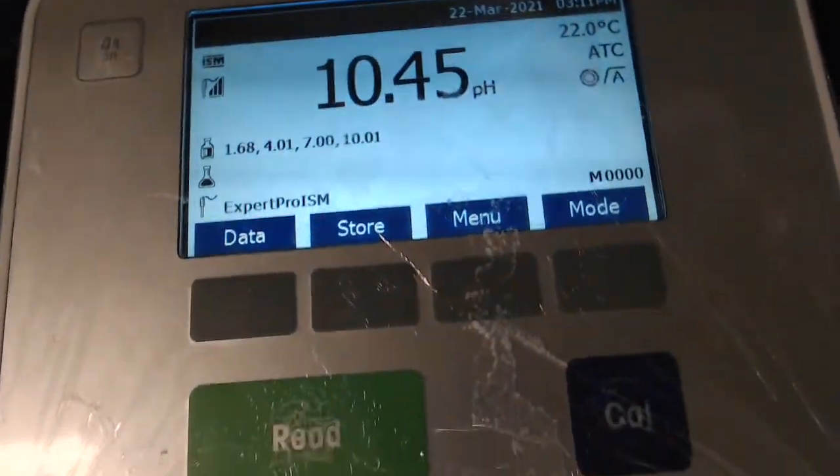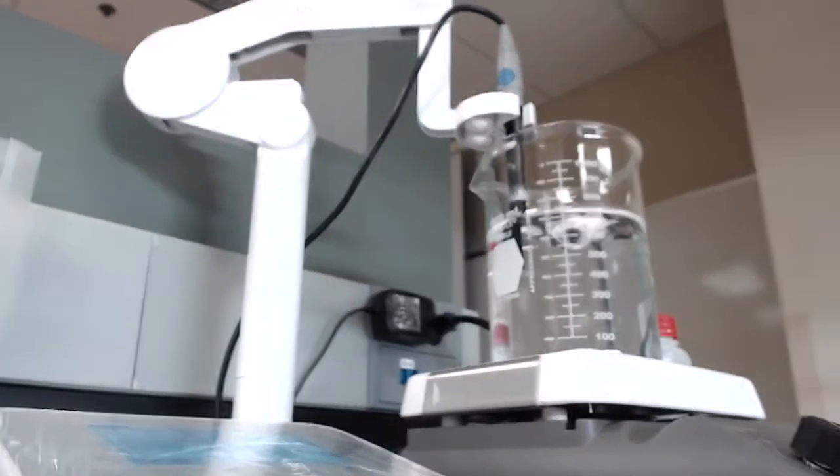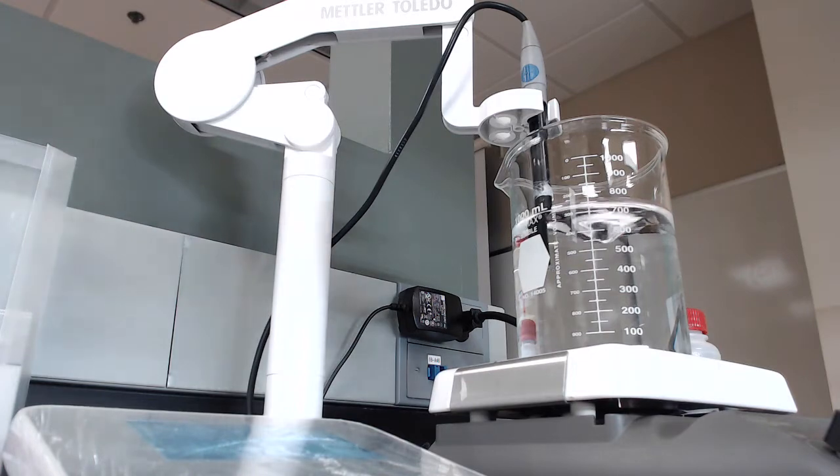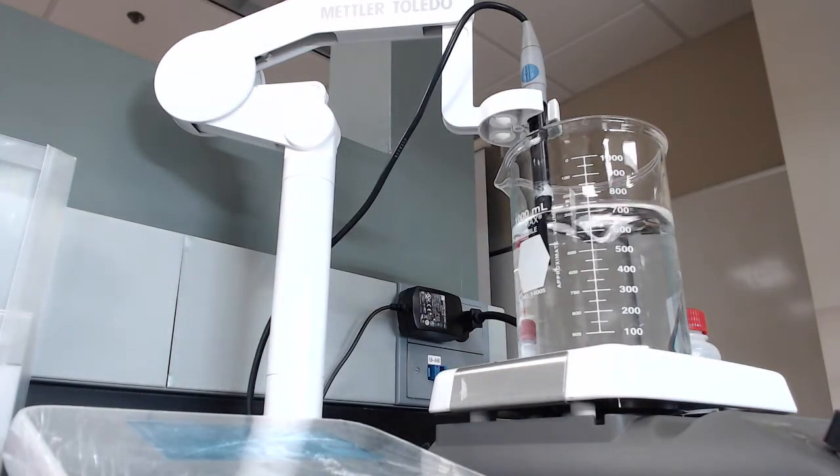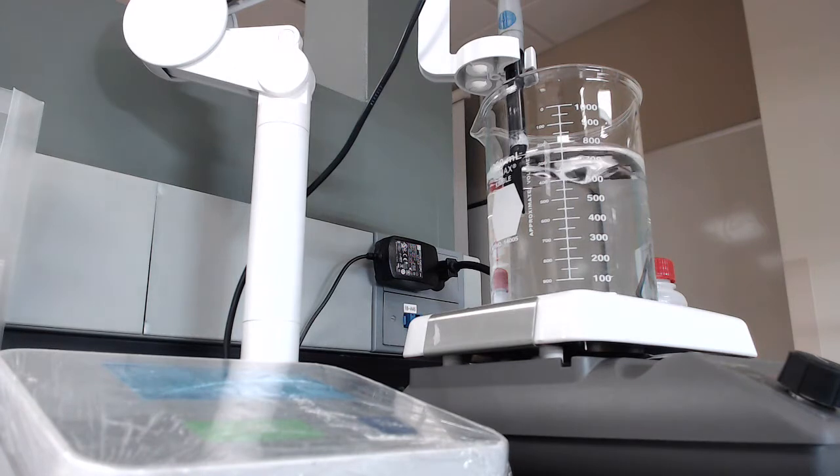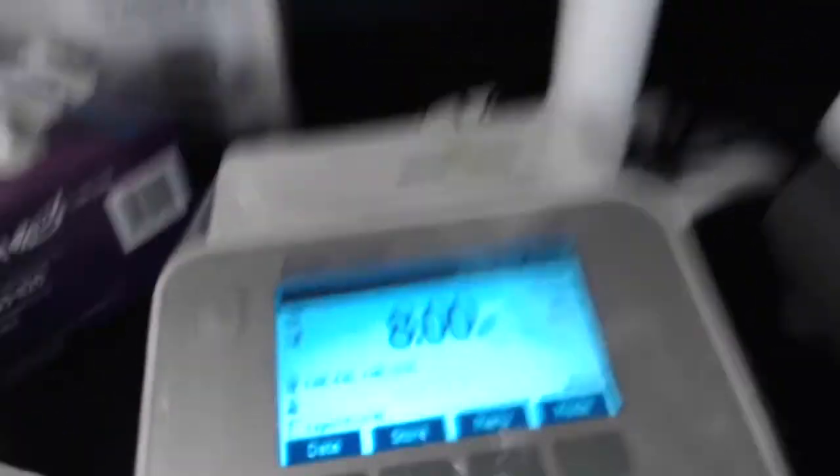All right, so the Tris has dissolved nicely in solution and I've got the pH meter in there. And you can see that as predicted, the Tris causes the water to be fairly basic. So we need to correct this and bring it down to 8.0. So that's going to require adding some of this, this is one molar, or it would be more appropriate to call it one normal hydrochloric acid. I could make this a quicker process by adding concentrated hydrochloric acid, but that kind of has the downside of I could really overestimate how much I'm adding and go under 8.0. So I'll be back once we get that done. All right, so I have added what feels like about a thousand gallons of hydrochloric acid, but we are finally there right at 8.00, which is exactly where we want to be.